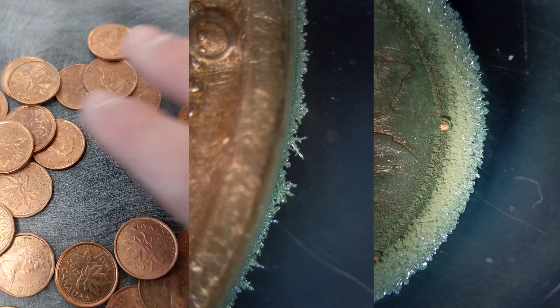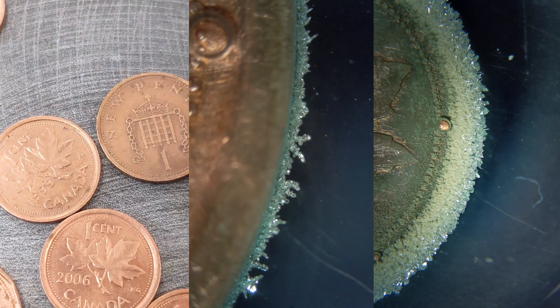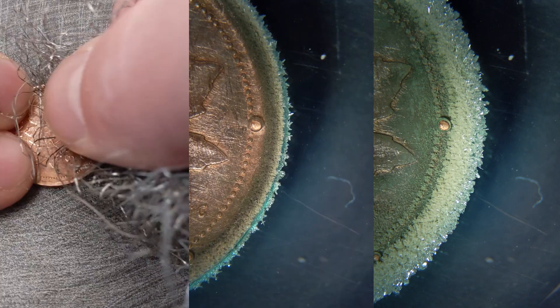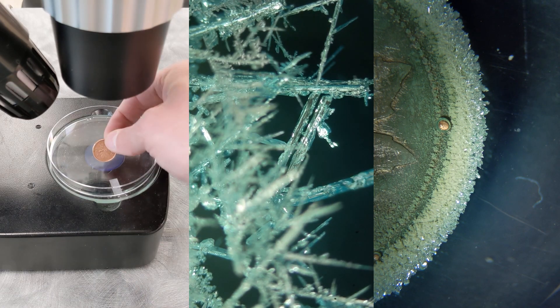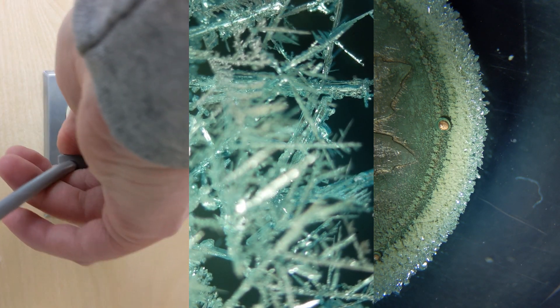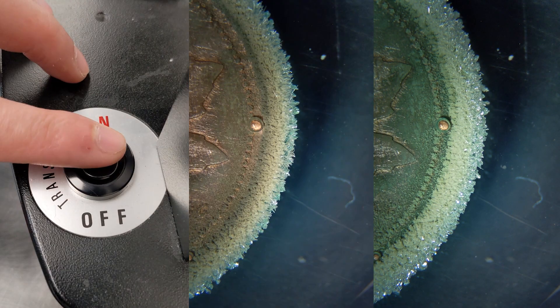It's going to stop when one of those two things runs out. Silver crystals continue to grow as they pull electrons off of the copper, and then the copper leaves the copper metal once its electrons are stolen from it. It's an example of a type of chemical reaction we call a single replacement or single displacement reaction. It's also an example of a redox reaction — a reduction-oxidation reaction — where we have one species that's reduced and one species that's oxidized.